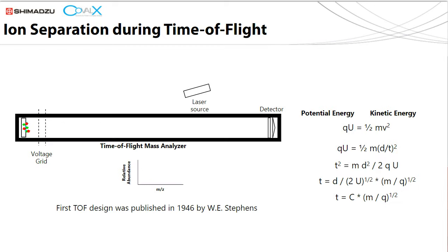Okay, the mass analyzer or ion separator that the OmegaTOF uses is, of course, a time-of-flight or TOF mass analyzer. The way this works is the ions are going to fly down the time of flight and be detected upon impact at a detector. As discussed in the last slide, we'll create the ions by mixing them with a matrix, and then we'll use a pulse of laser light, and the ions will fly down the time of flight being separated.